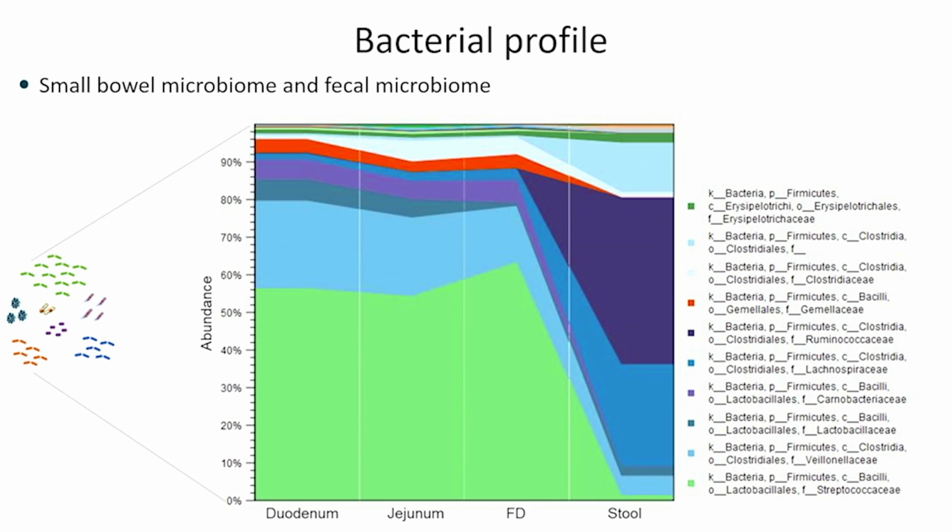From this microbiome, the duodenum in this case, the green microbe over here takes almost 56% of all microbiome present in that specific site, right? And then you check the blue one, the green one. Let's check who is the green one. This first one was from the Streptococcaceae family. And then we have a second one, the light blue one, that is from the Veillonellaceae family, right? And then I can see who they are, and I can see how much they take of this microbiome.